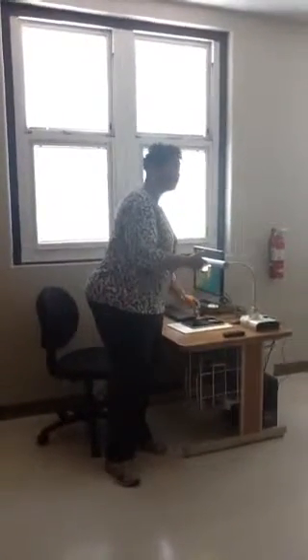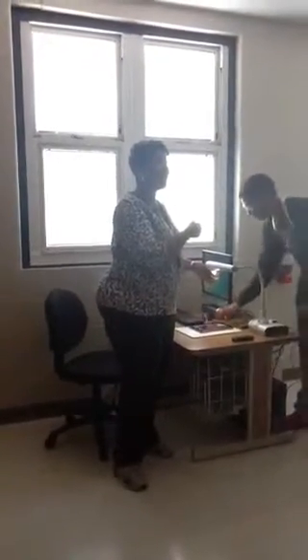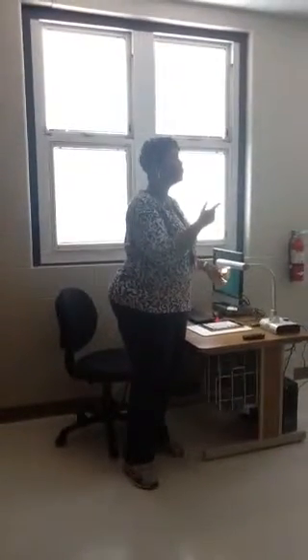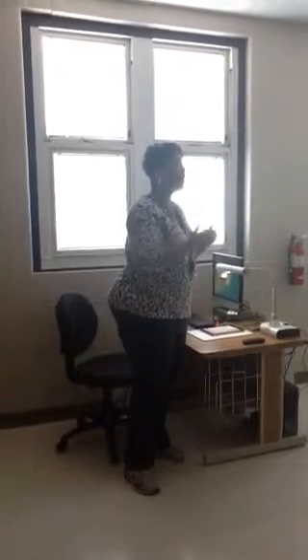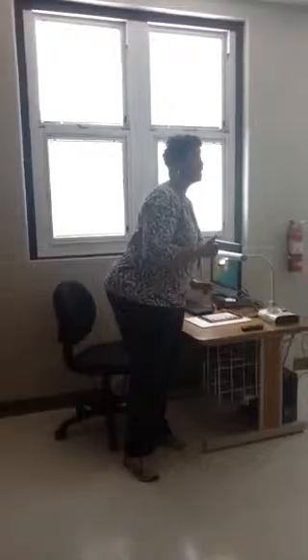So what I would like for you to do, since we are doing the earthworm and the crayfish today, is to go ahead and do this for the rat the next time we get into class, so you will not be unaware of what's going on, okay? Now I'm just going to take one of the videos. It says this is a regular video of an earthworm from YouTube. This is simply something you can do for the rat as well.